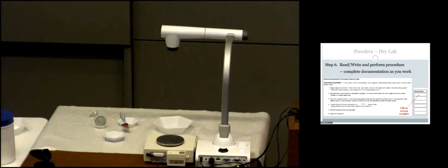So does anyone know the ingredient? And you can flip through the wet lab. We're almost to the wet lab. Look on the ingredient list there. What are we adding on your next prescription with the camphor menthol? You can see the camphor is the smelly thing. Now, some people love camphor, but some people hate camphor. So that's the smelly thing. What ingredient are you adding? What did I say? You're going to add, dropwise, methyl salicylate.